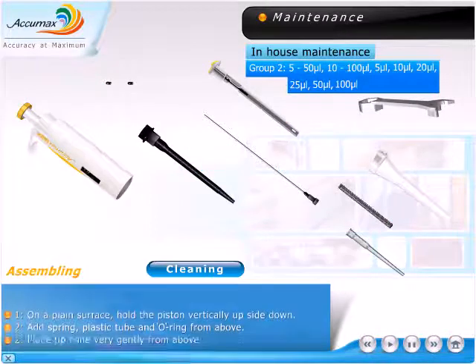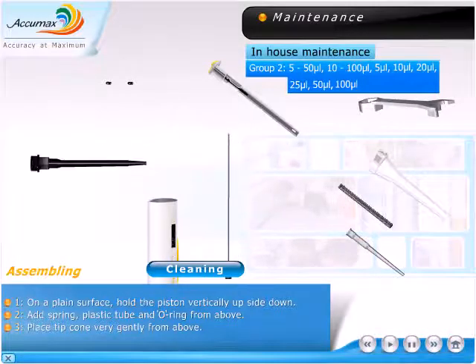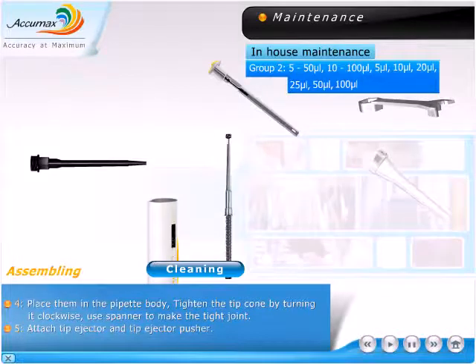Assembling. On a plain surface, hold the piston vertically upside down. Add spring, plastic tube, and o-ring from above. Place the tip cone very gently from above.